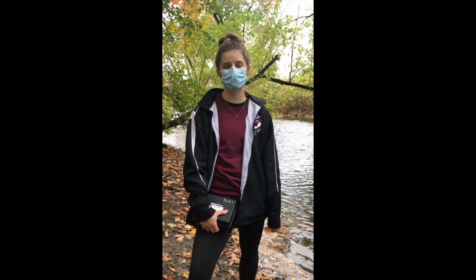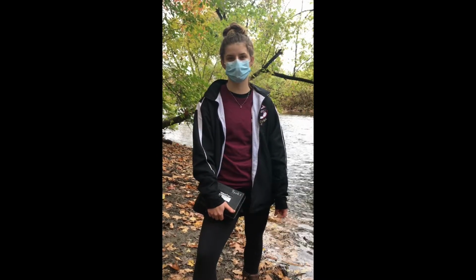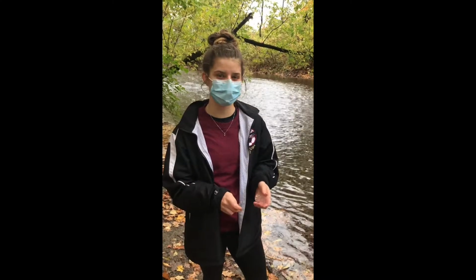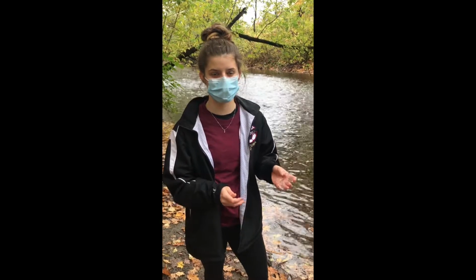Have you ever thought about how dissolved oxygen gets into different bodies of water? Dissolved oxygen is replenished in the water by diffusion from the air above and is produced by the plants found in the water. There are two different methods that can be used to measure dissolved oxygen in bodies of water, and today I'm going to be showing you one of those methods.